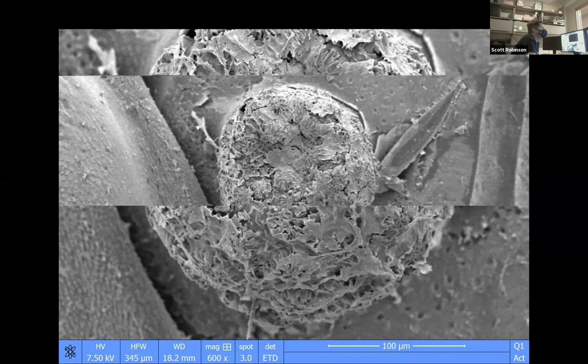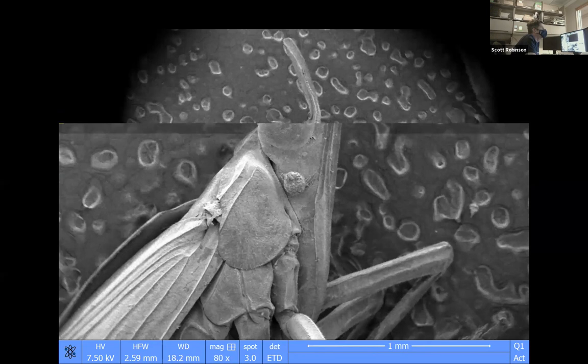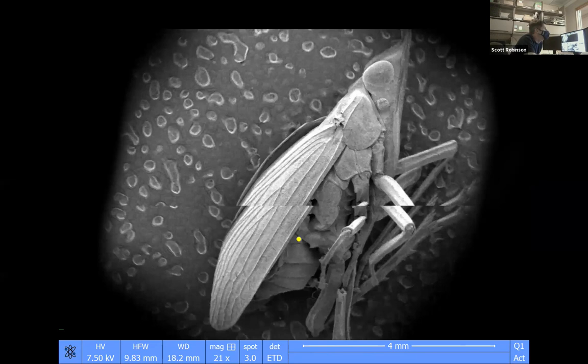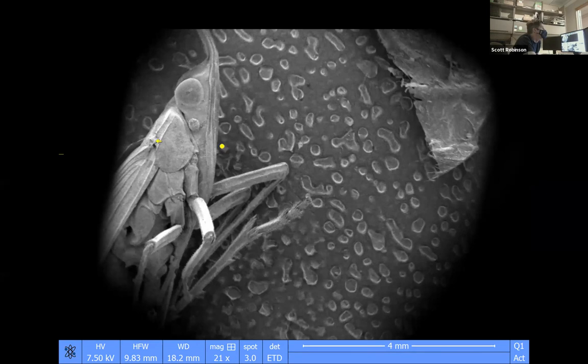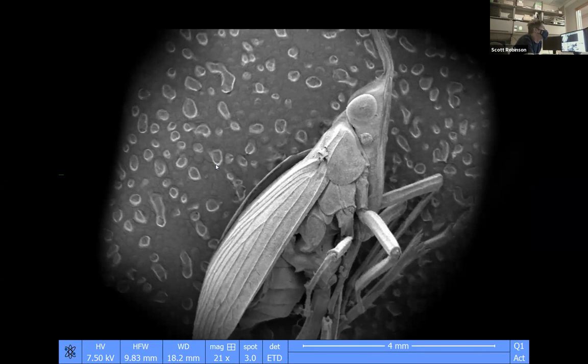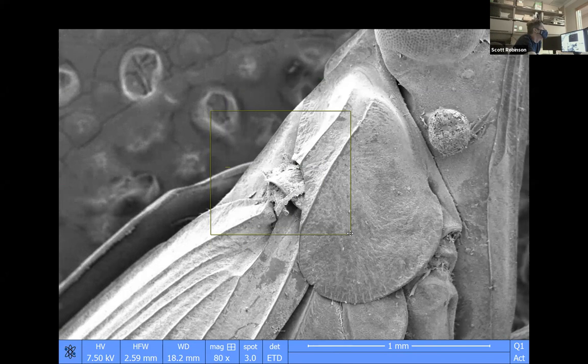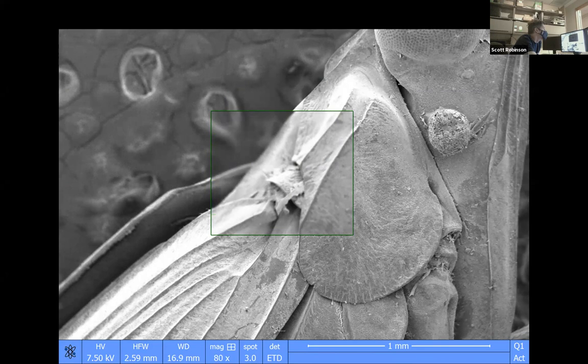This one would have piercing, sucking mouth parts. They're just tucked underneath the body. So we have a long face in the opposite direction of what a weevil would be. And you can see its wings, which look like elytra, probably. Is that what you say, Scott? The wings, the elytra? Yeah, so they wouldn't be referred to as elytra, though they look hard, like elytra. The elytrum would be like the shell of a ladybug. True bugs sometimes have hemielytra, which is the same thing, but only half of the wing is like that. But I don't know if you refer to it as elytra.